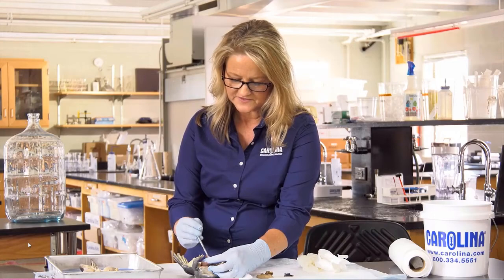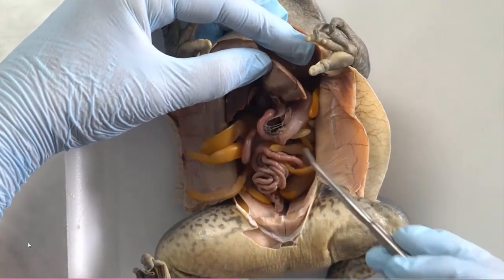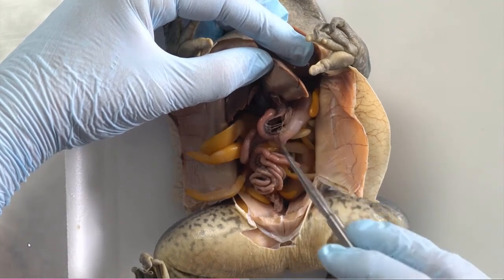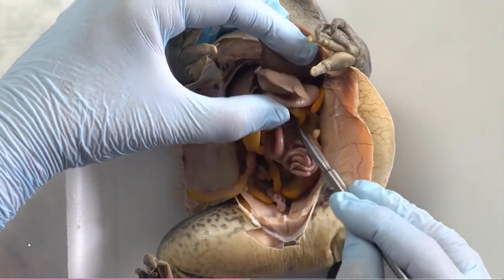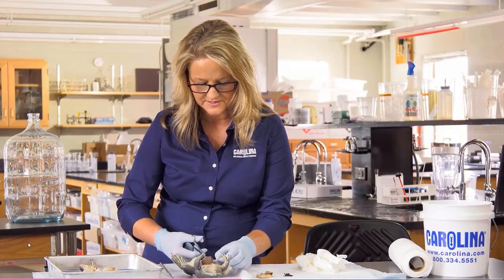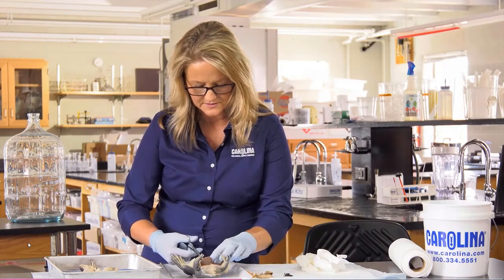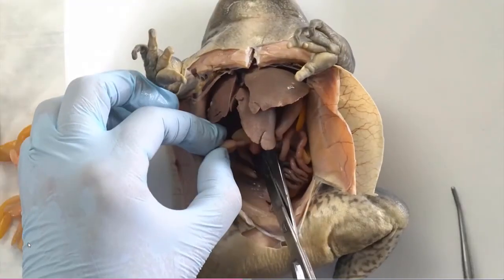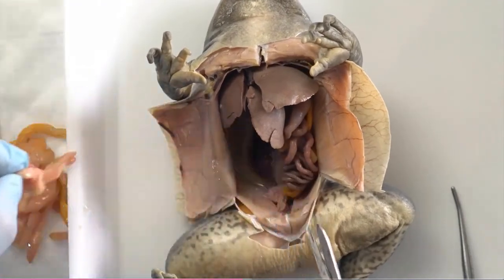When we notice these fat bodies, which were not overly present in the female due to the masses of eggs that were present there, we notice that they're gathered around the reproductive structures. Very much like in human anatomy, these are energy storage features. They're also important in temperature, keeping the frog warm, and also as an energy store during hibernation.